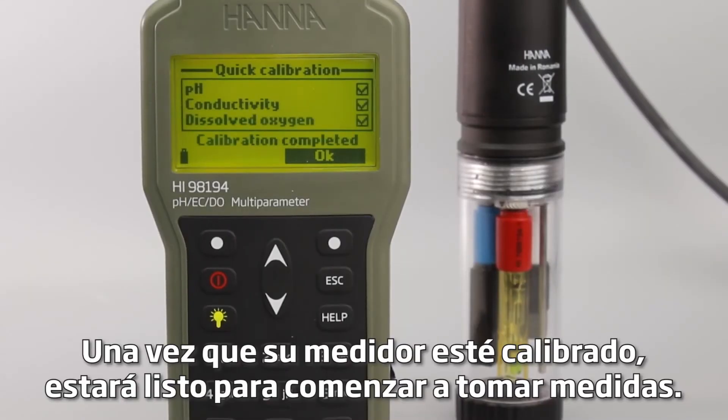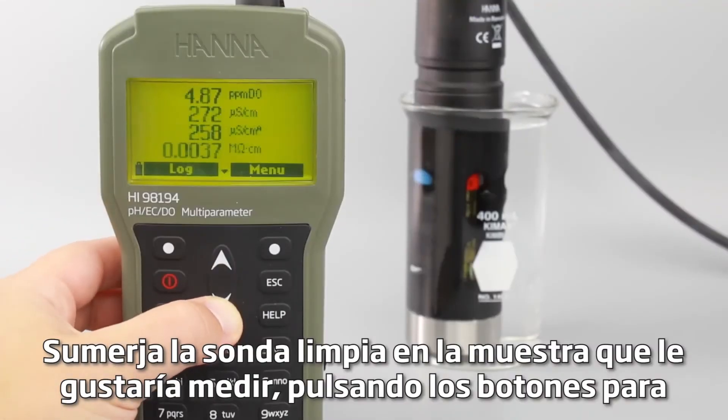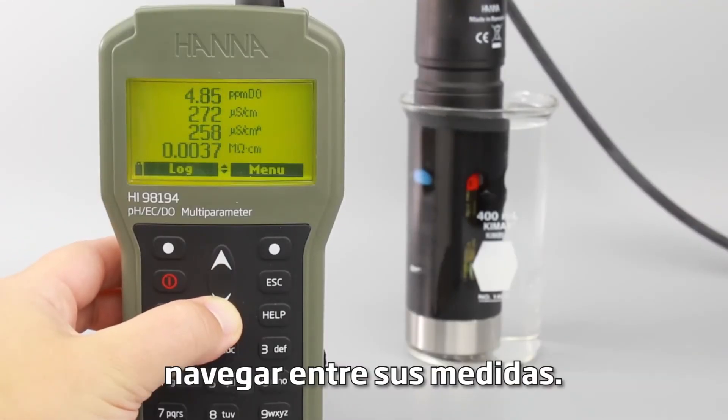Once your meter is calibrated, you're now ready to begin taking measurements. Submerge the clean probe into the sample you'd like to measure, pressing the buttons to navigate between your measurements.